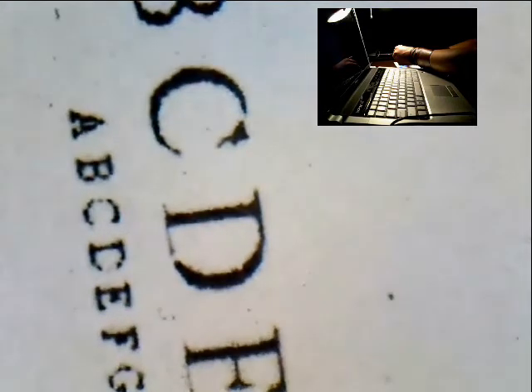I've also played a little bit with some of the stage ones, and I don't actually like them near as much as this. I've got some items that I'm going to show you with this video. The first thing I've got is this piece of paper. I'll be using it to teach microscopy to some kids. This is eight-point font, and then down here this really, really tiny one - I took a screen capture of the eight-point font and dropped it down to 30% of its original size. It's very tiny, so you've got to squint at it to see it. I'm going to set this on here, turn on the LED, brighten it up. You can see I'm bringing this into focus. There we go. So that's pretty good focus there.